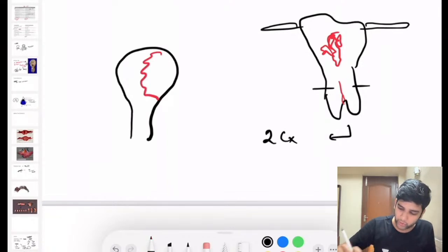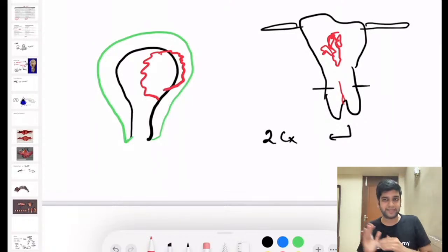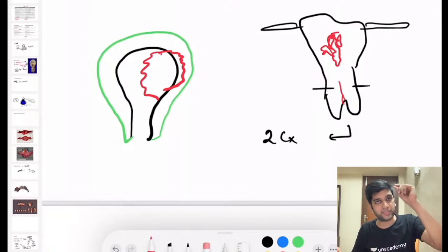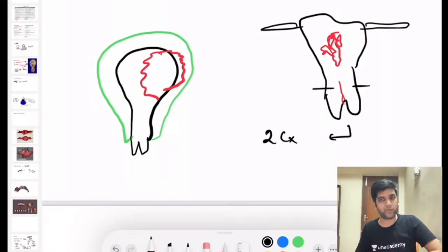And that tumor is going to be myometrium. Let's say that we'll put the myometrium in a different color. Fine. Let's assume it's going till this. Okay. This is the slice. Take the entire slice and ink the entire surface from the isthmus till the top. It can also include the cervix as well, doesn't matter. You can cut the entire thing, take out a slice separately.